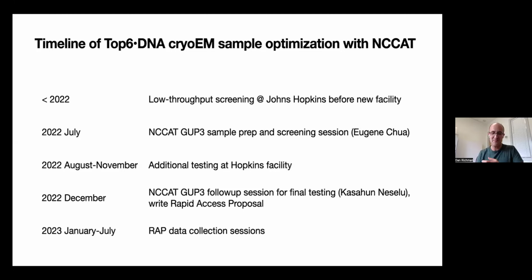it was actually a productive experience because it gave me a chance to learn hands-on cryo-EM skills with, for example, side entry cryo holders, and had me figuring out how to use EPU kind of on my own, not a lot of expertise around, like I mentioned. So it was an important learning experience.